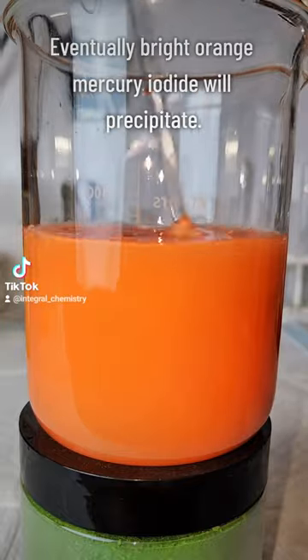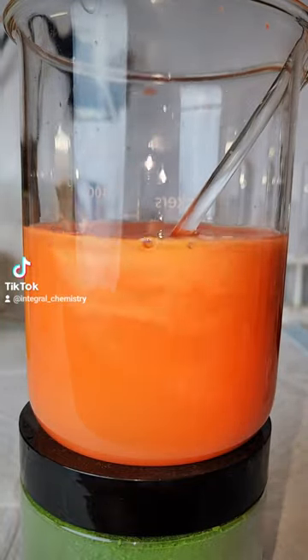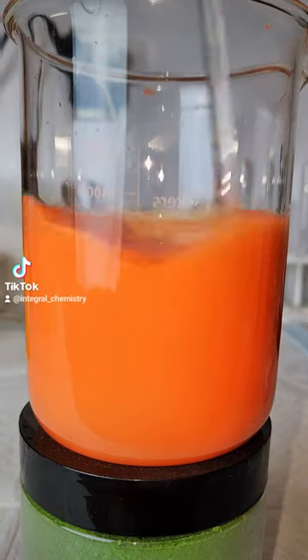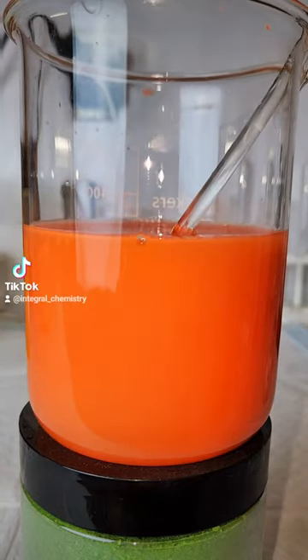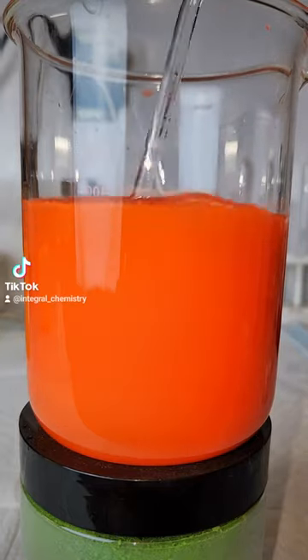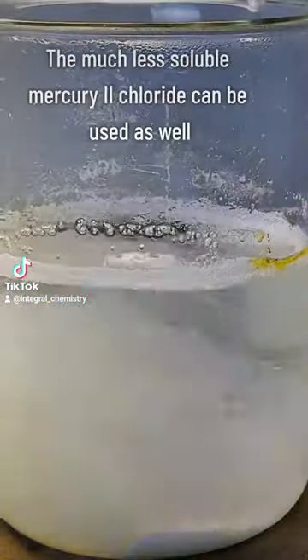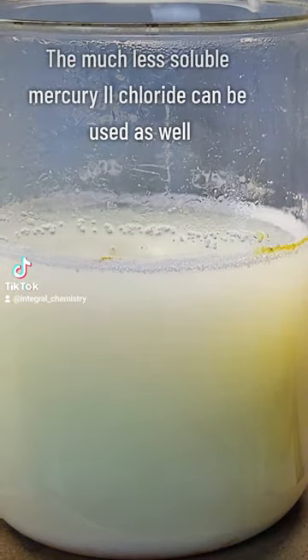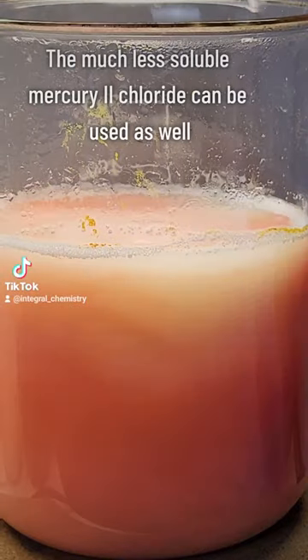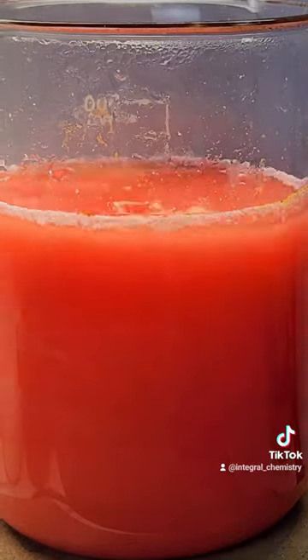This process can technically be done with any mercury 2 salt, and I even tried this with mercury 2 chloride, which still worked even though it's a lot less soluble than the mercury 2 nitrate. If you have a mercury 1 salt, it's fairly easy to convert it to a mercury 2 salt by the addition of sodium hydroxide, which will precipitate mercuric oxide. Mercuric oxide is already in the plus 2 state, so adding any kind of acid to that will result in a mercury 2 salt.